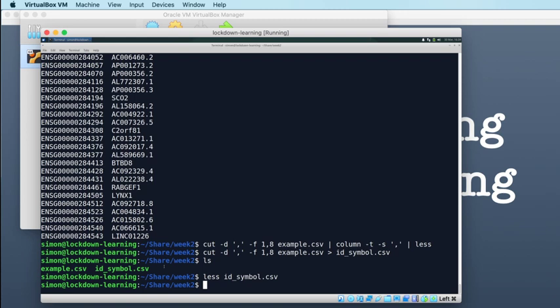It doesn't direct the command line to use a particular program with that file like it would in Windows, for instance, where a .csv file will be opened by Excel. There's nothing telling the command line to use this file as a CSV file. That's not the purpose of extensions at the command line.